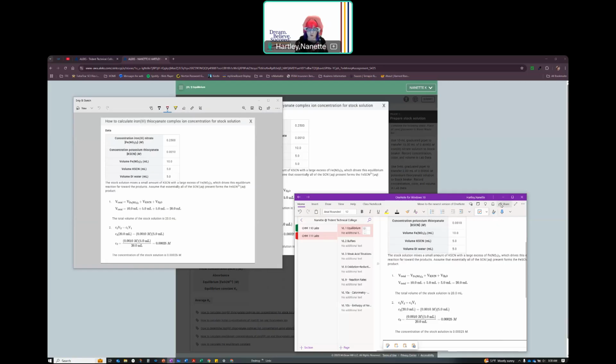Okay? If you were in a 111 lab, in a physical one, we would be asking you to keep a physical lab notebook. And you would be expected to write all this stuff down. Okay? So not only would you have your data tables, but you would be expected to keep a lab notebook. And then you could use that lab notebook when you're taking the post labs. So that's what I'm doing here, is I want you to use this information to pass those quizzes.